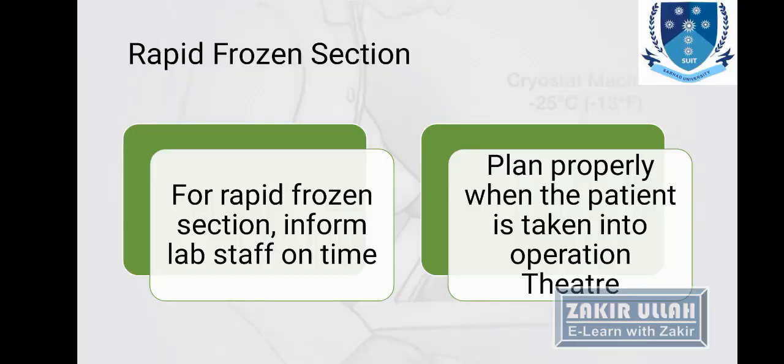Rapid frozen section is another type of procedure, which is an emergency procedure. It is done in a machine called a cryostat, in which the environment is about minus 25 degrees centigrade or minus 13 Fahrenheit. For rapid frozen section, the lab staff should be informed at least one day before the procedure, or as early as possible. The lab staff should be informed because when they are informed, they will prepare the machine for the procedure, because the machine needs to be prepared early, and all the instruments inside the machine need a specific time to get ready.